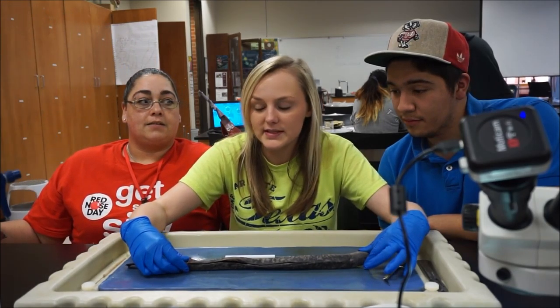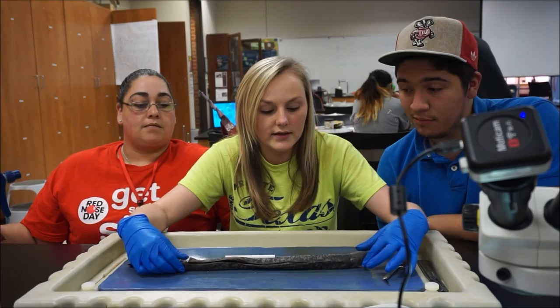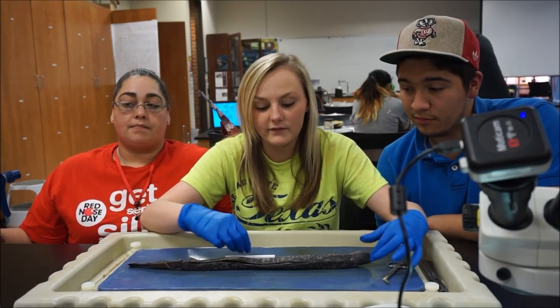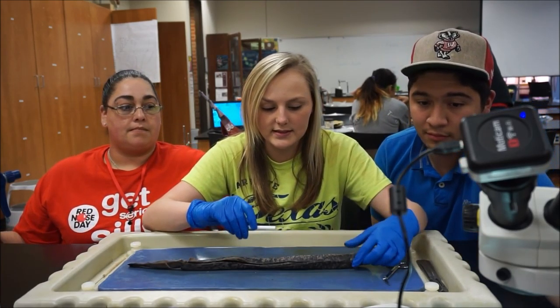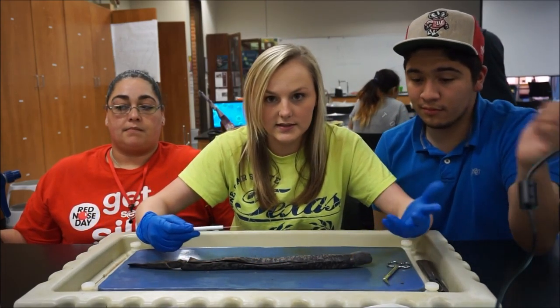This is our lamprey. It is representative of the Phylum Chordata, which within the Chordata, it is representative of the subphylum Vertebrata, which basically means that it has a vertebra, which is the backbone, basically. So it has some bones.